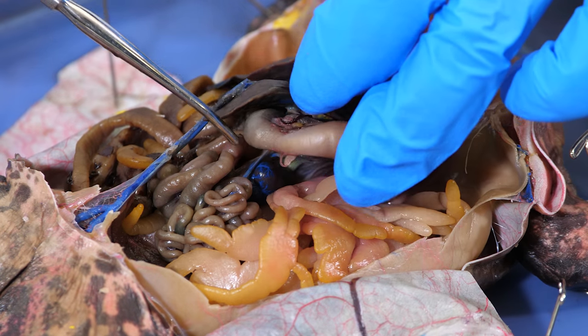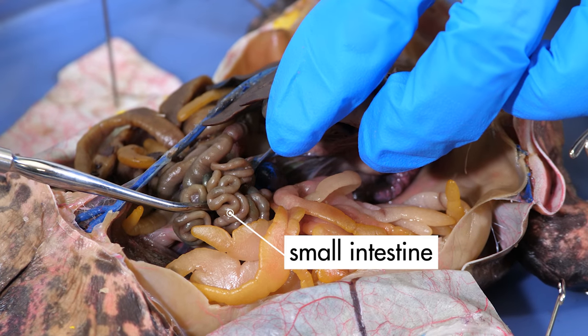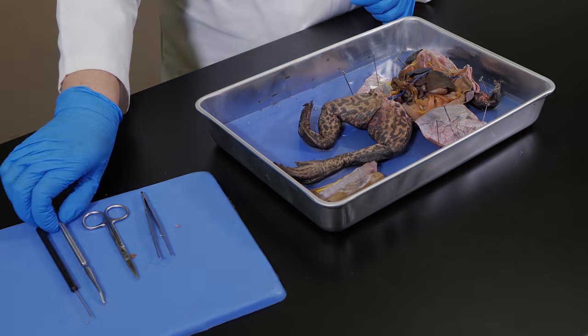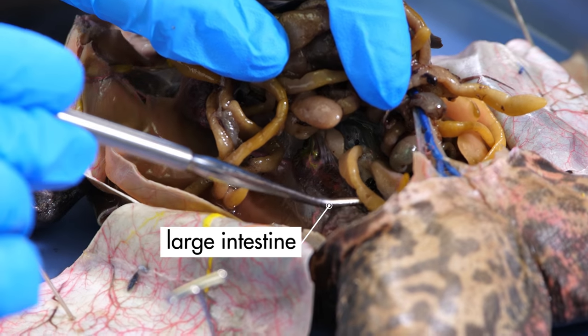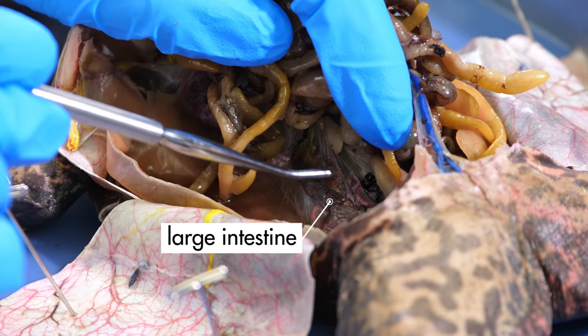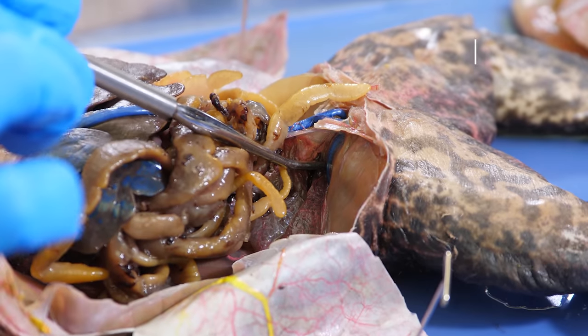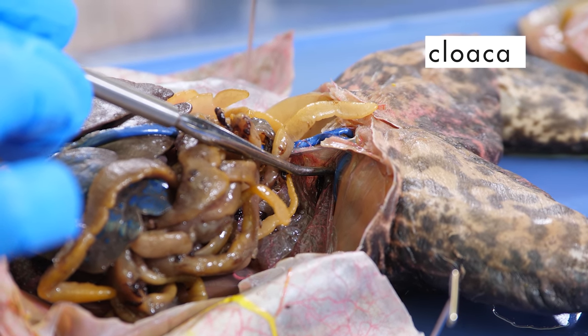After food is partially digested by the stomach, it passes through the pyloric sphincter into the small intestine. Digestion continues in the small intestine, and digested nutrients pass through the walls of the small intestine into the blood vessels lining the mesentery. Undigested food passes into the large intestine as waste. Notice that the large intestine is not as long as the small intestine, but it has a larger diameter. Waste from the large intestine is excreted through the cloaca, which is the opening at the end of the digestive system.